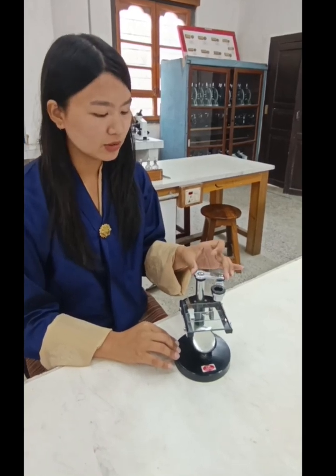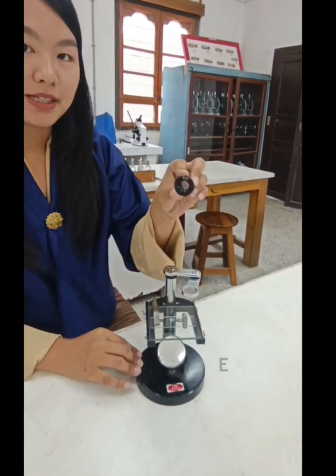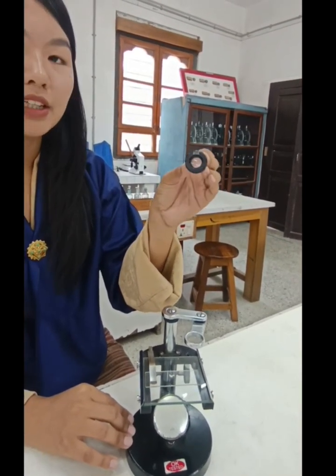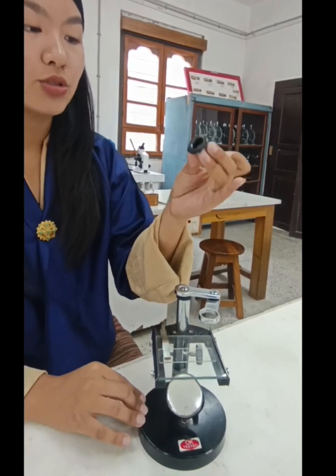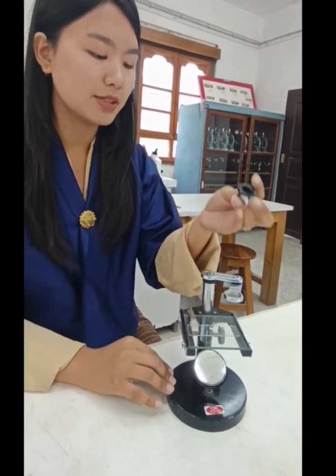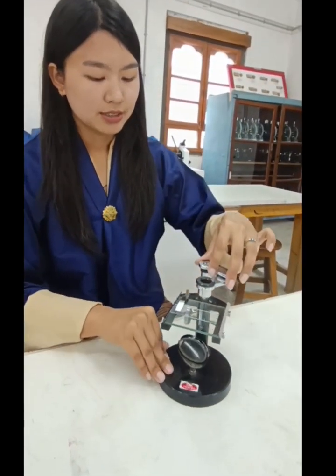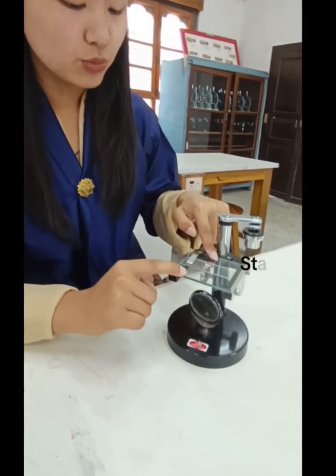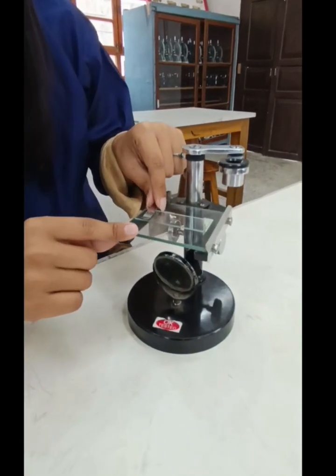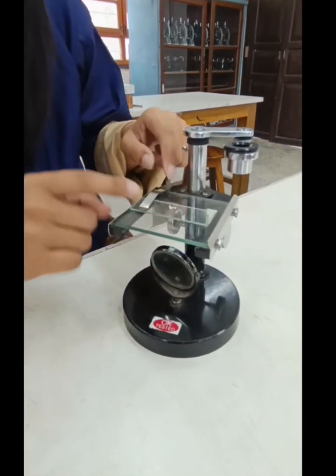Now let's talk about the parts of the dissecting microscope. This is the eyepiece and it helps to magnify the image. The magnification of this eyepiece is 20x, so it will magnify the specimen 20 times. The next one is the stage, where the specimen to be viewed is placed. The next is the stage clip, which holds the specimen firmly.